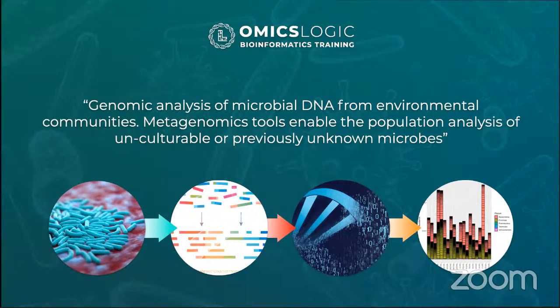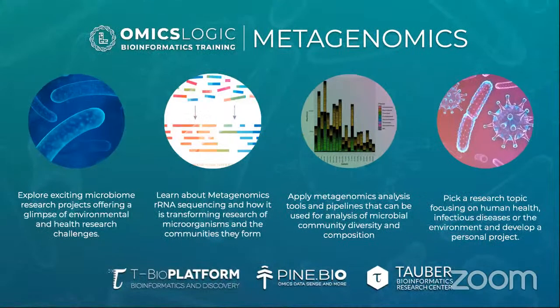So in the context of this program, we're going to find different examples where we will see the application of microbiome. We will learn how to analyze metagenomic data, gain insight from data by mapping it onto reference databases, and we will guide you on how to select a project of your own that could relate to either clinical, psychological, maybe soil and environmental samples. So we'll provide a number of curated data examples for you to choose from to work on a project of your own. So let's talk a little bit about the history of metagenomics.